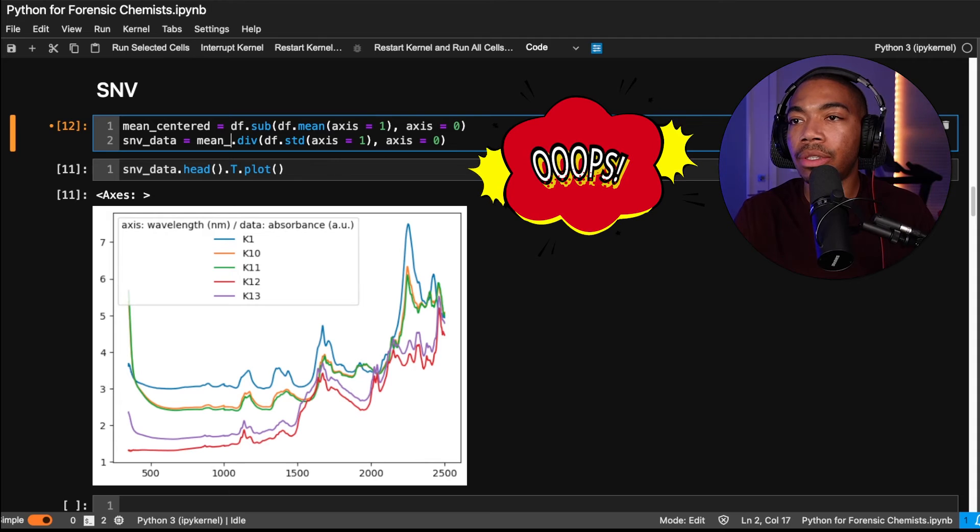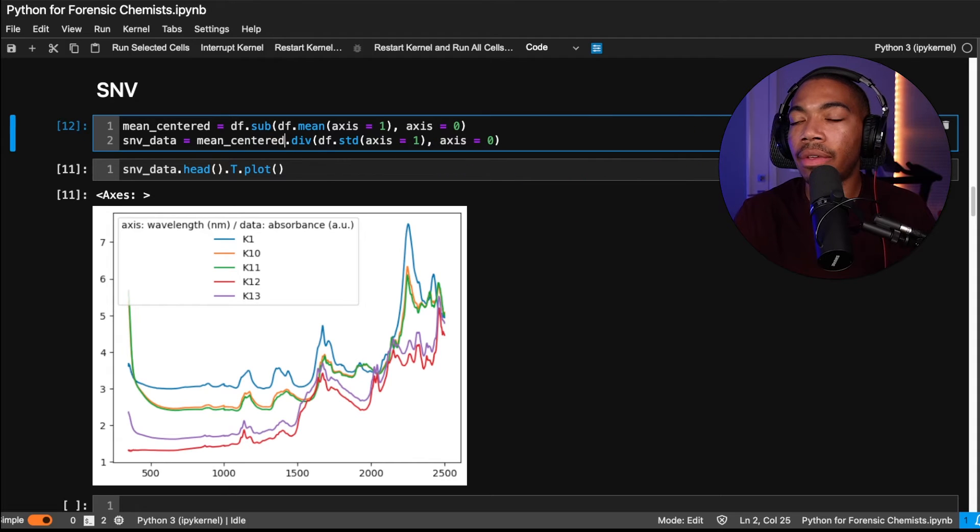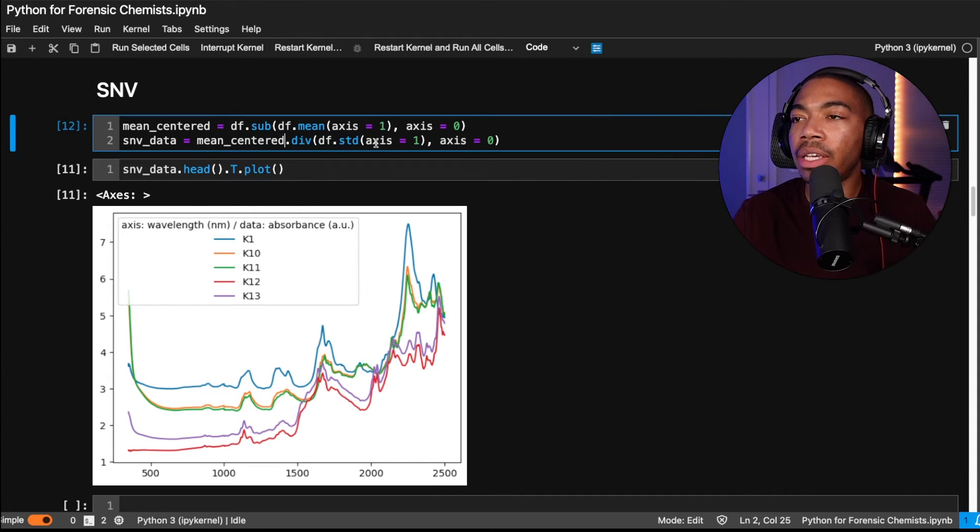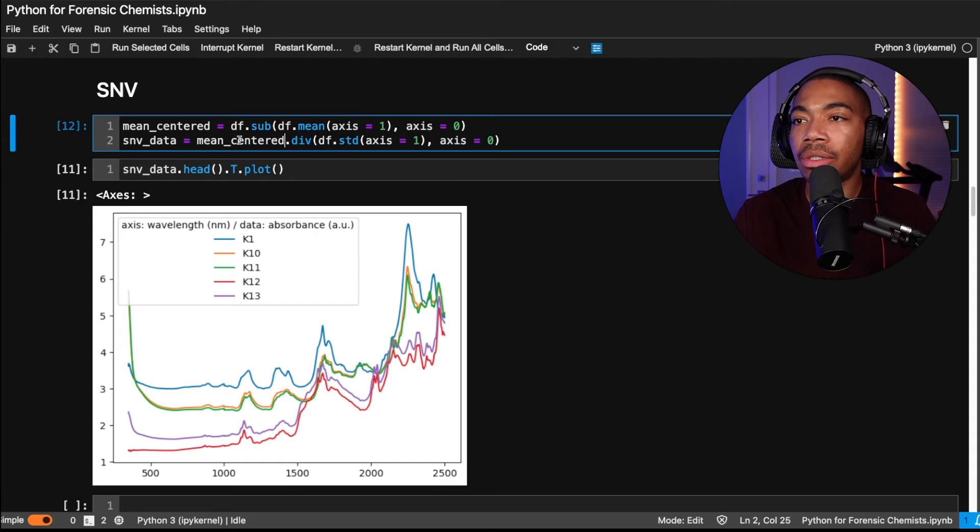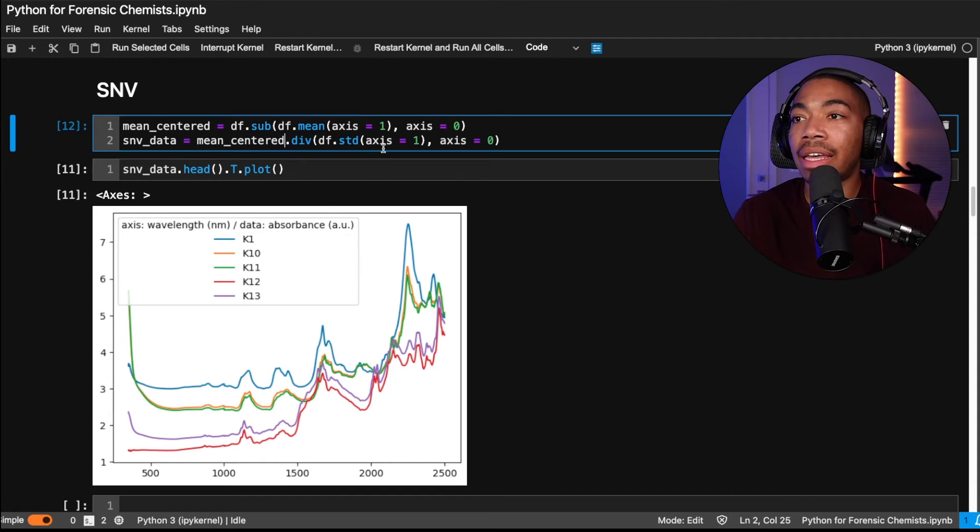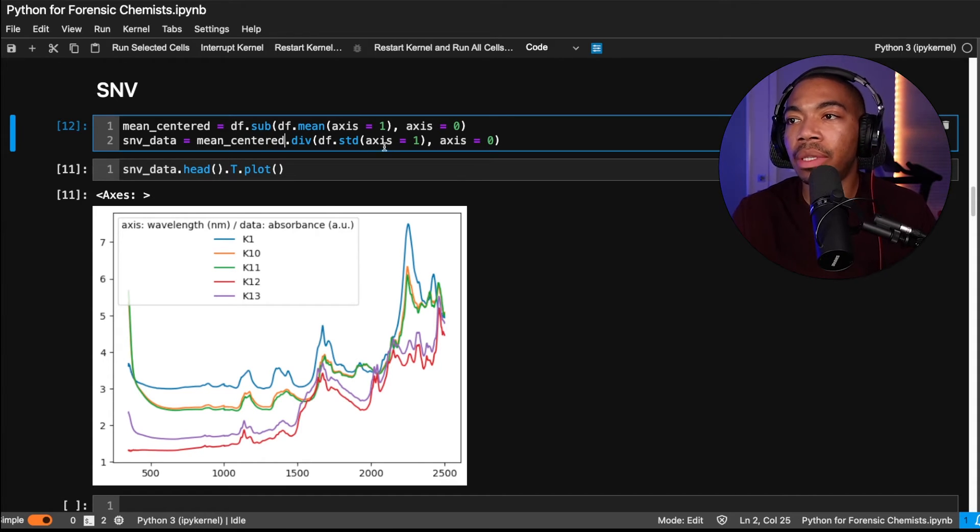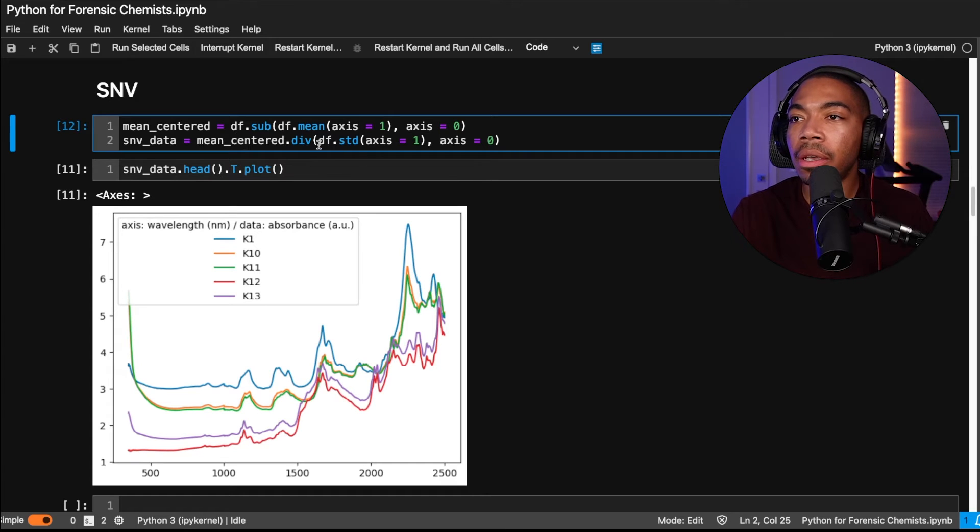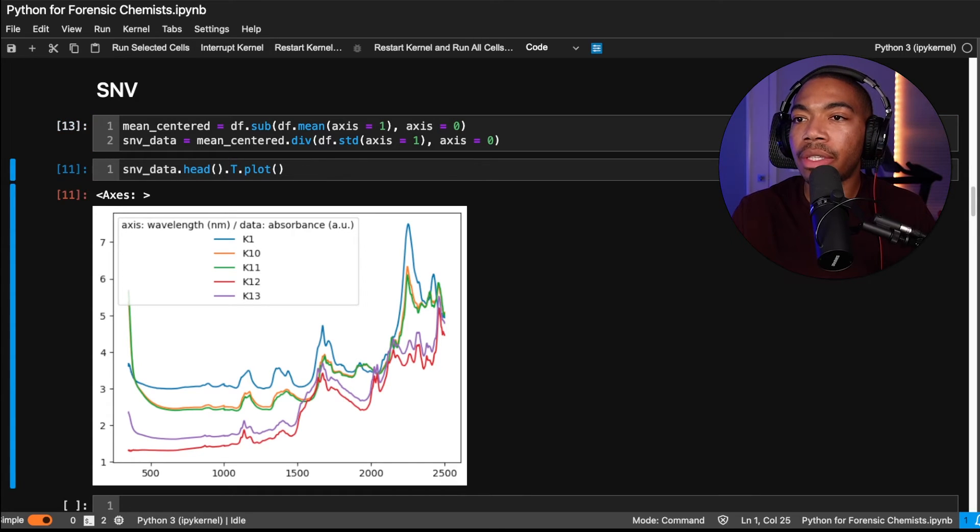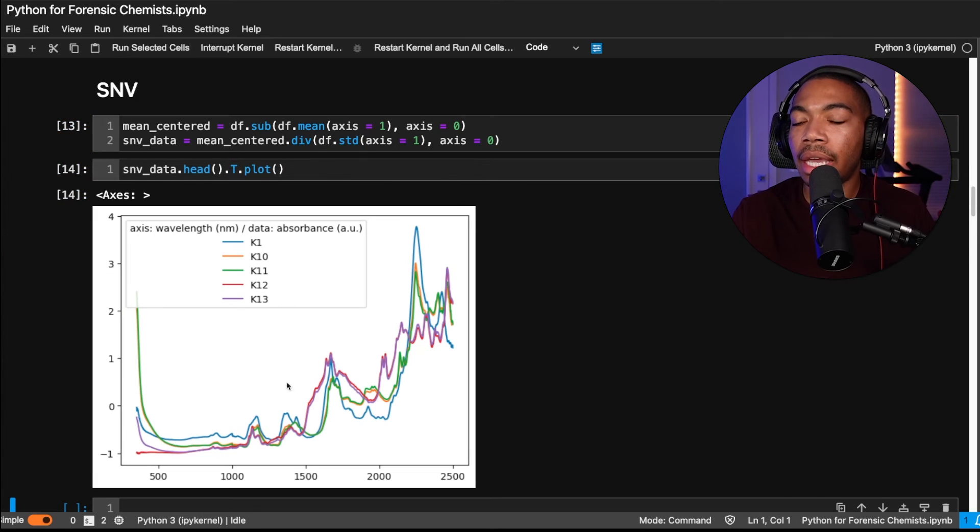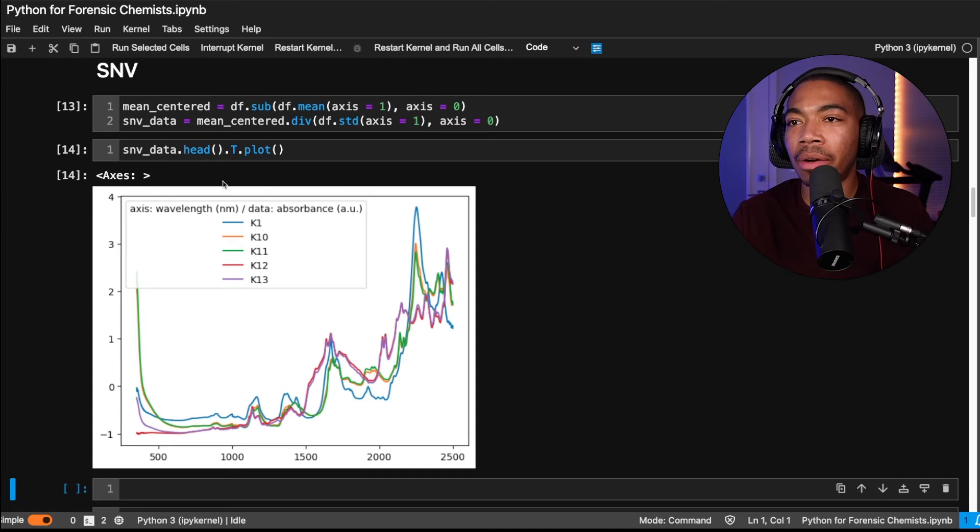This should be mean centered, not df. So we want to compute the standard deviation of the original data frame, but then take the mean centered df and divide that. So this is how we do the z scaling, essentially. And so let's run this again. And there we go. It looks much better.